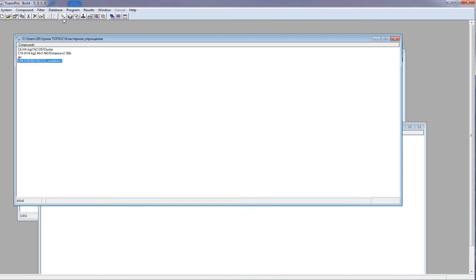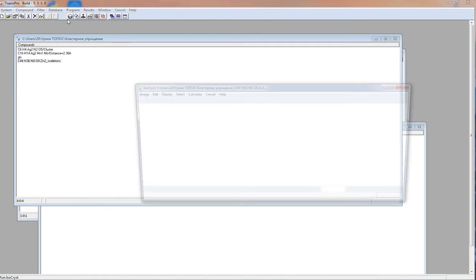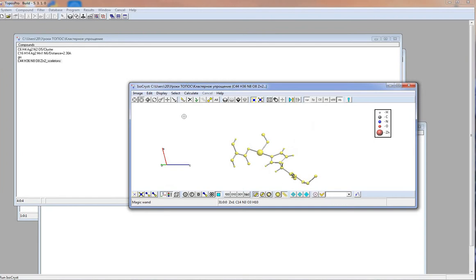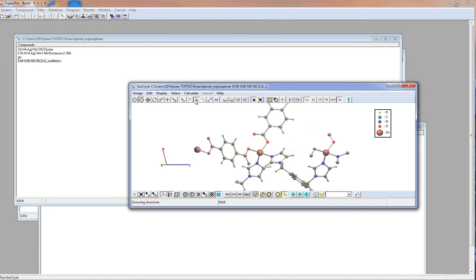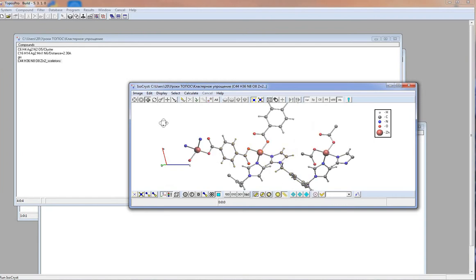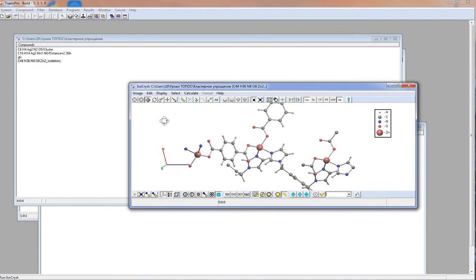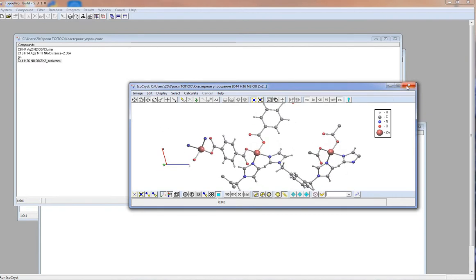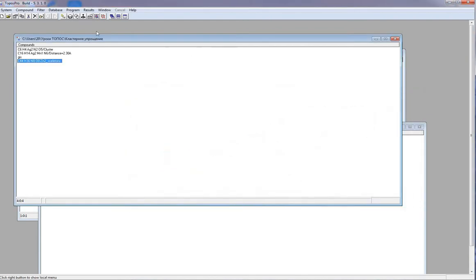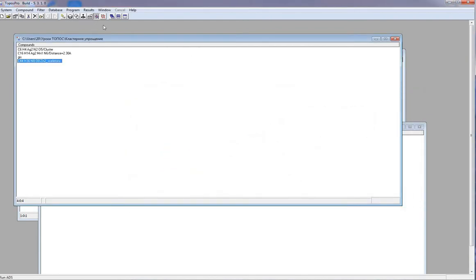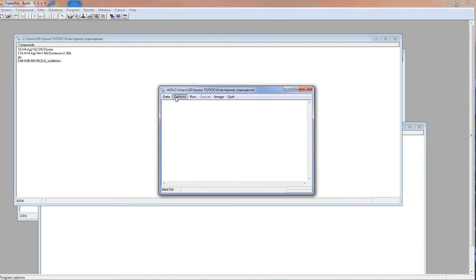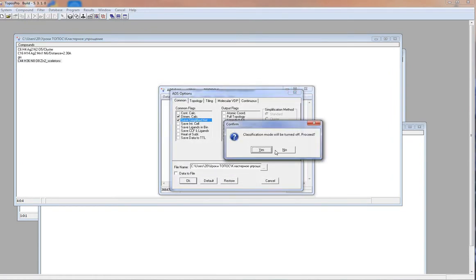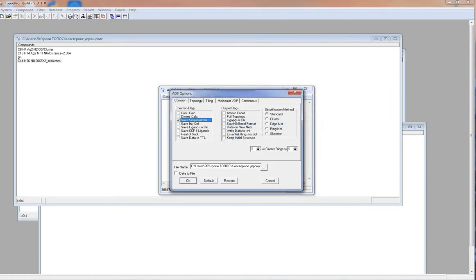Let's look at the structure. As you can see, it has 5 and 6 membered rings. Let's transform 5 membered rings to edges. I run ADS, options, save simplified net, simplification method skeleton.